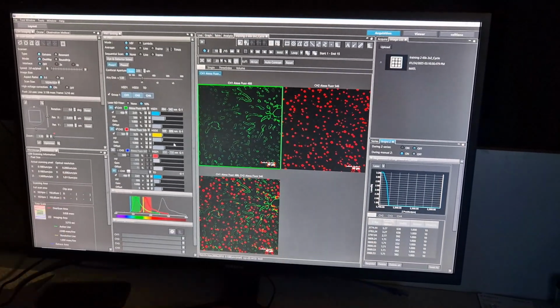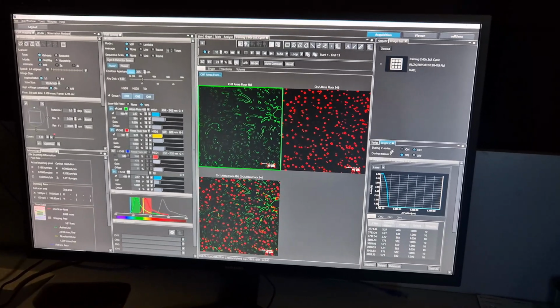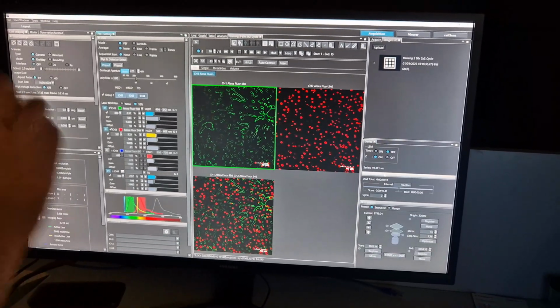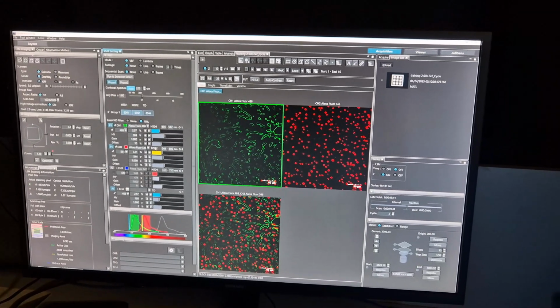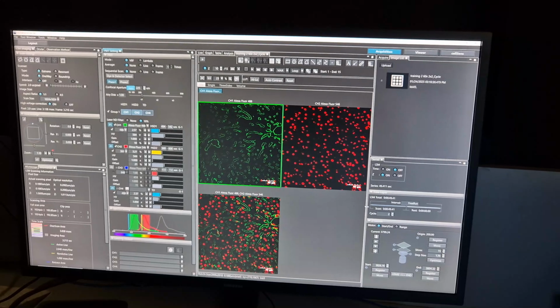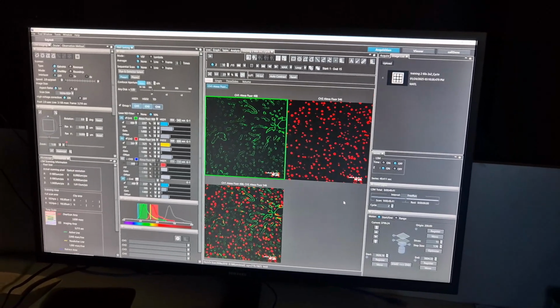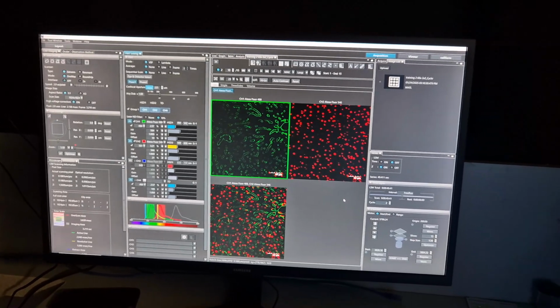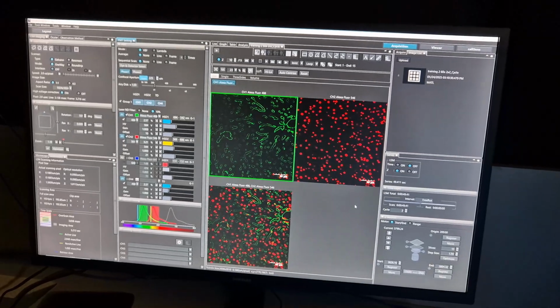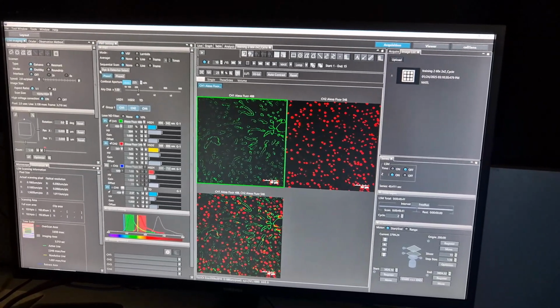Yeah, so this is something you can use to help you when you're imaging through Z, only if you're struggling to deliver light deeper. It's just one technique you can use to improve the Z imaging. It's going to be useful if you've got really thick, really dense samples and you can't get light through. I guess basically if the normal Z doesn't work, it's the troubleshooting.